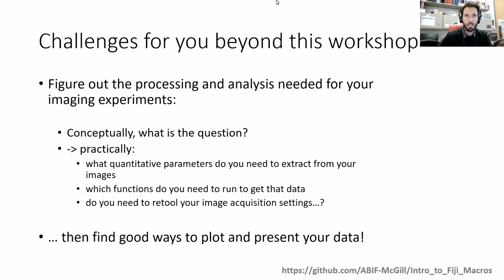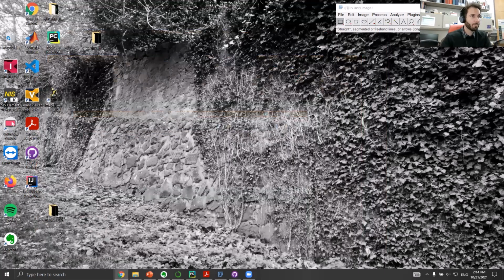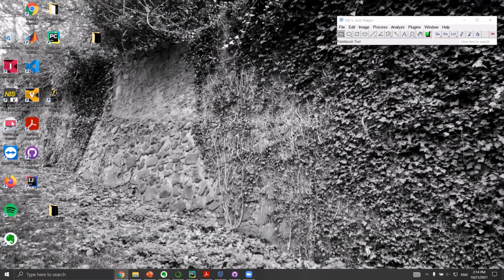There's no questions in the chat yet, I think. So we'll just get going. Please open Fiji, so you can launch Fiji, and we'll get going from there, step by step. I already have Fiji open here, and we'll walk through step by step. Mostly we'll start with exercise 1, of course. We'll try exercises 1, 2, and 3 in that order, and we'll see where we get to by 4 o'clock.